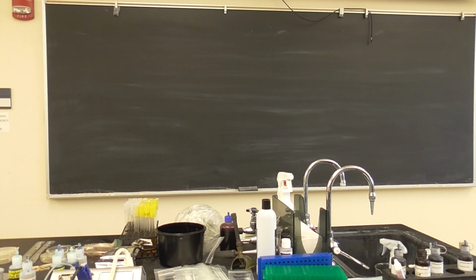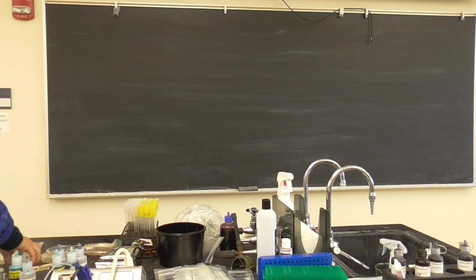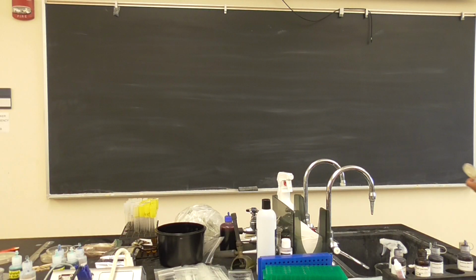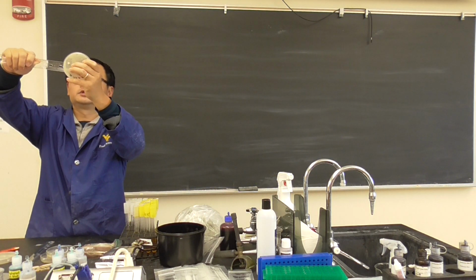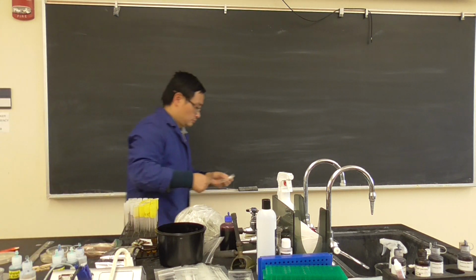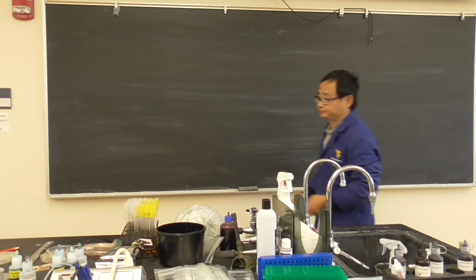Can you please measure it? I'm going to give you the ruler. Now make sure when you do these things, I want to give you an example. Let's say kanamycin, right here. Okay, measure using millimeters. Measure the diameter. Okay, like that. If you already measured, it's good. You go ahead and measure, and you can measure your own later on.